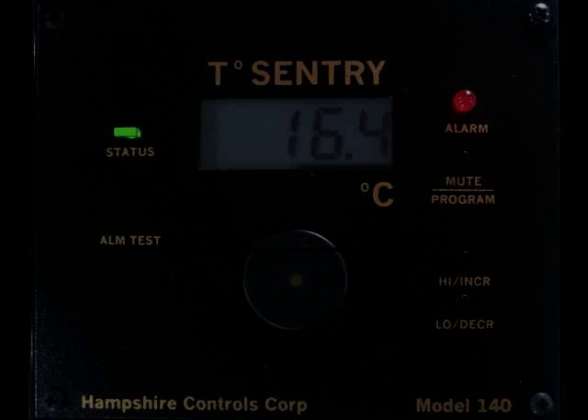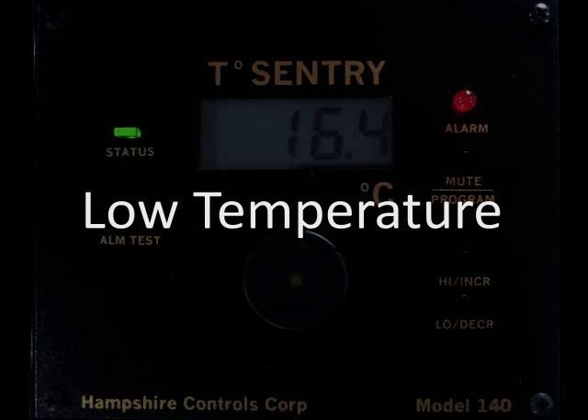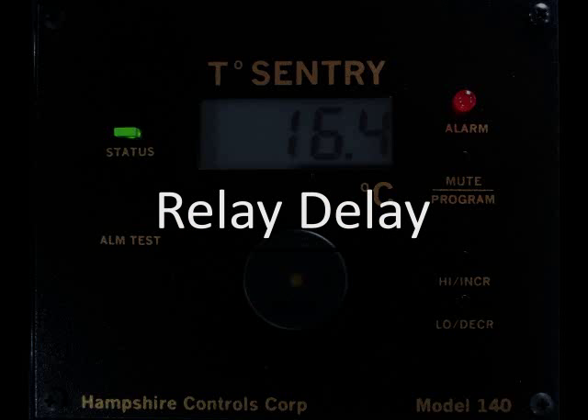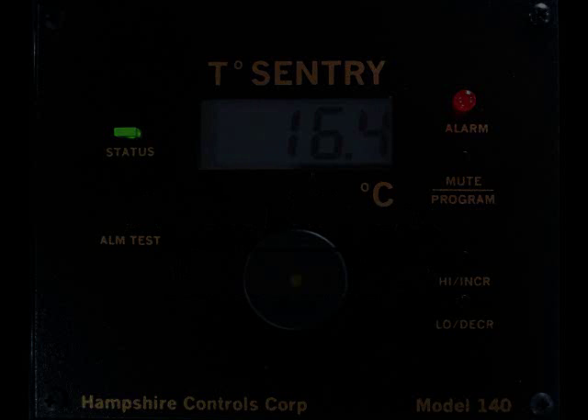For this demonstration I have chosen: high temperature limit 5 degrees centigrade, low temperature limit 1 degree centigrade, alarm delay 5 minutes, relay delay option 10 minutes, alarm silence mute 15 minutes. Let's do it.